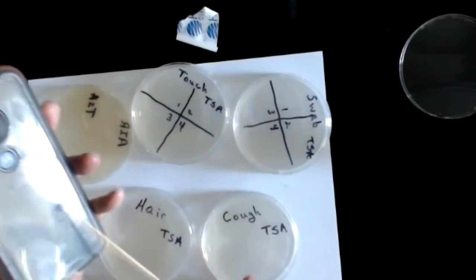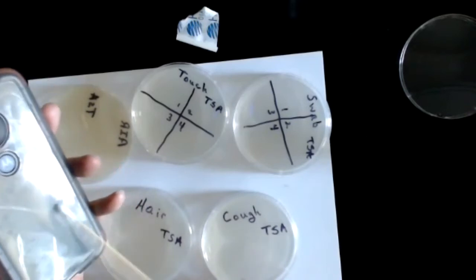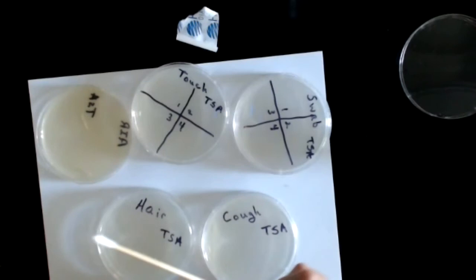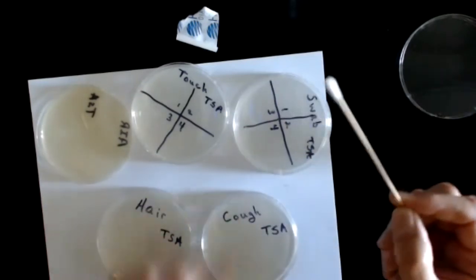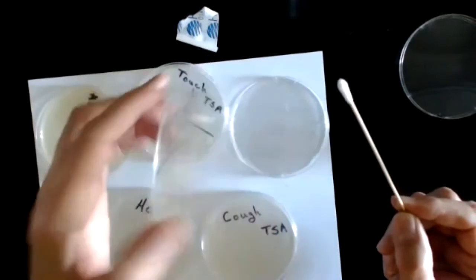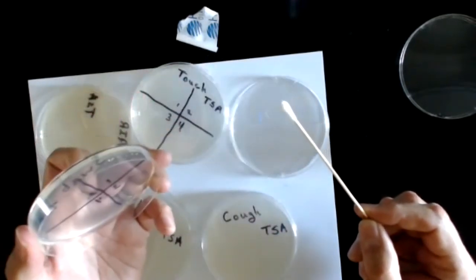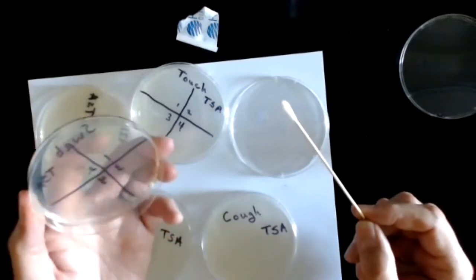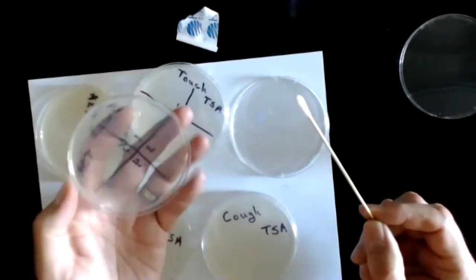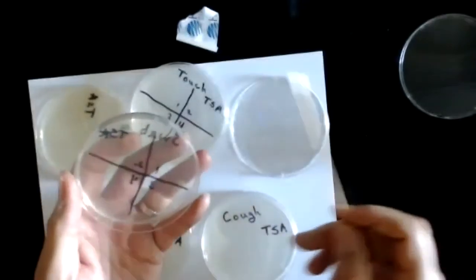Once I've done this for 10 or 15 seconds, hopefully I've picked up about anything that would be there. I then take that swab, grab the swab plate again, lift the bottom up, and turn it right side up so I can see the surface of the agar. This is swab number 2. So I am going to swab surface number 2 right here.